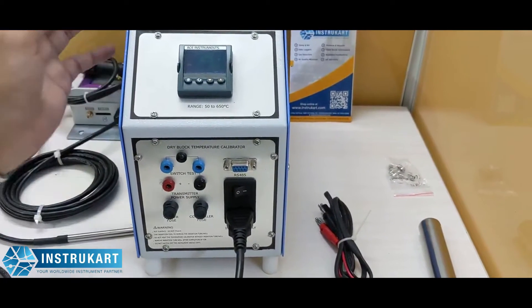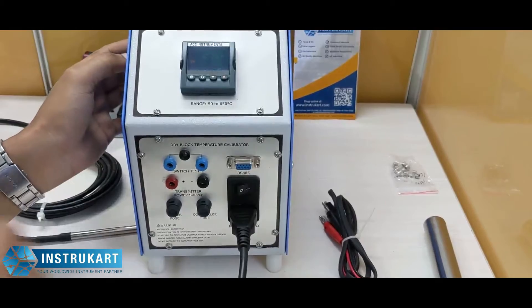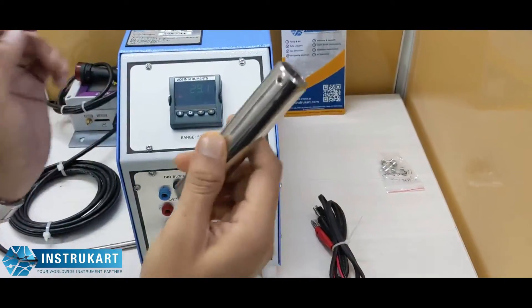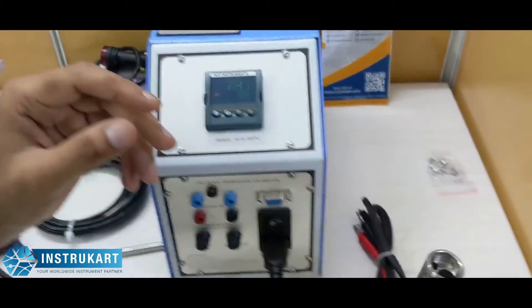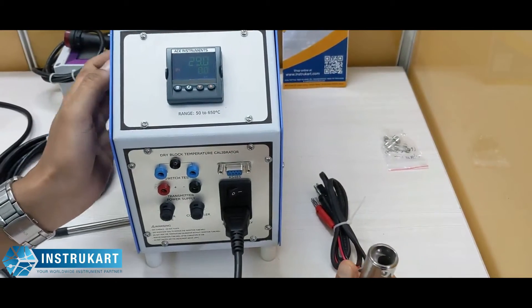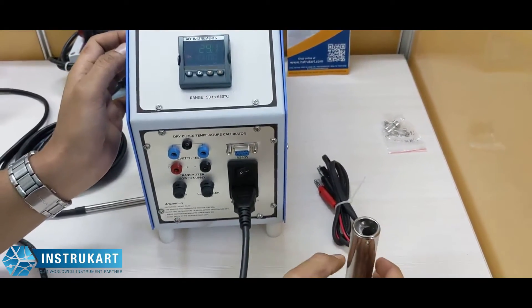The resolution for this is 0.1 degree Celsius and the block depth for this dry block is 120 mm. The insertion tube depth is 110 mm and the approximate weight of this dry block is 8.5 kg.